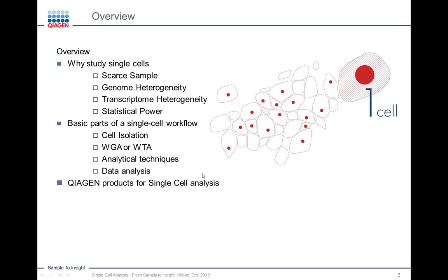I'll cover whole transcriptome and whole genome amplification technologies. Most of the molecular biology protocols we have aren't meant to deal with the amount of DNA or RNA that's in a single cell. There are a few that are. Maybe you have an extremely sensitive PCR assay, for example, where you can work directly on the DNA out of a single cell, a single genome's worth of DNA. But for the most part, it's usually necessary and quite often recommended to amplify the DNA somehow.